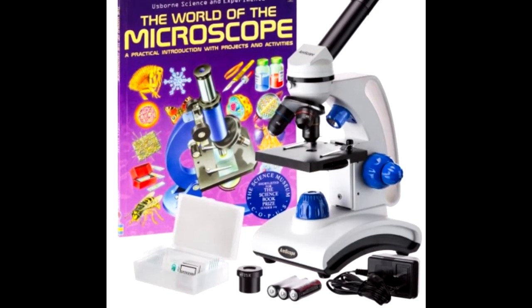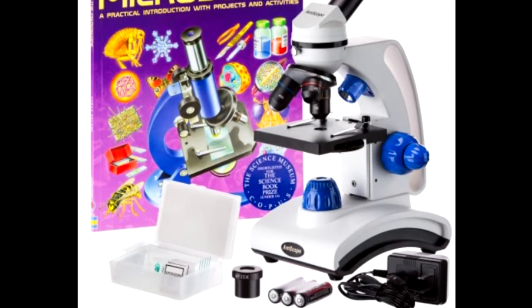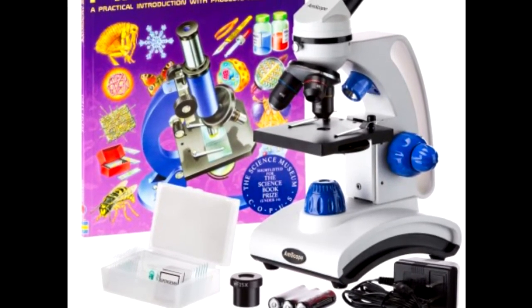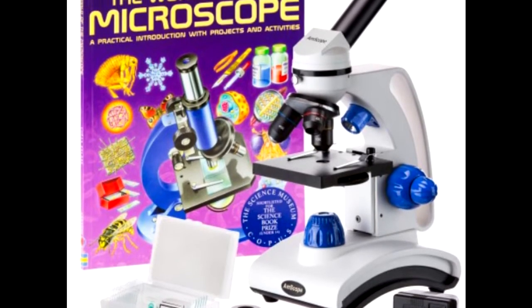This video will be an overview of the Amscope M162C Microscope, which is a great introductory microscope for kids. A microscope is a great educational tool for kids.